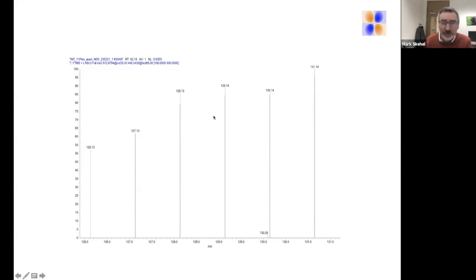I hope you can see, I'm not sure whether your screens are resolving this, but this is an 11-plex experiment, and you'll say, hang on a minute, there's only 1, 2, 3, 4, 5, 6 there, but actually if you look closely, there's another reporter ion here, here, here, here, and here. This technique relies heavily on the Orbitrap mass analyzer. You can't do this on time-of-flight instruments. You can't analyze 16-plex on things like the Bruker timsTOF. I think they claim you can get up to 10, but I would worry. So you need this high resolution to be able to use the 16-plex reagent.